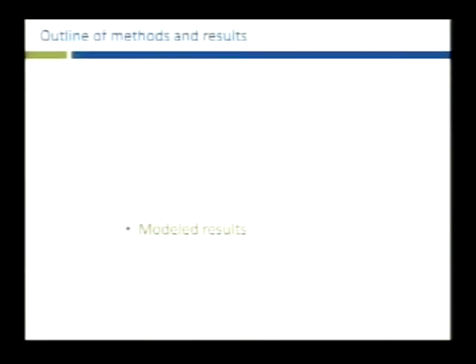It's a valid question to ask, what would be the effect of releasing these ROS into the air? The main issue we find in this case is that in the presence of ozone, this method had interferences and gave really high signals, but were due to the ozone and not to the other ROS. And this is the main reason why we couldn't measure ROS with the air cleaner that released ozone. Not that it's not produced, but it's just that the method wasn't really able to capture them.